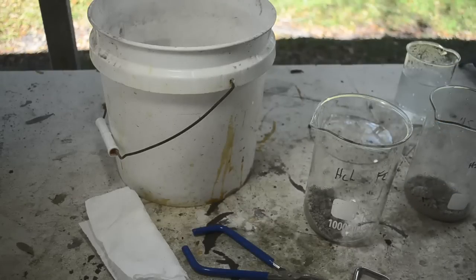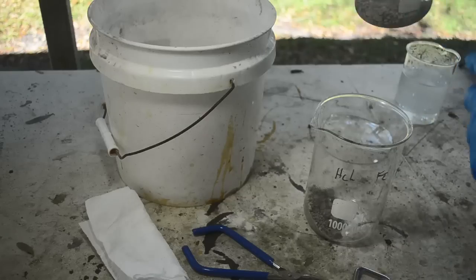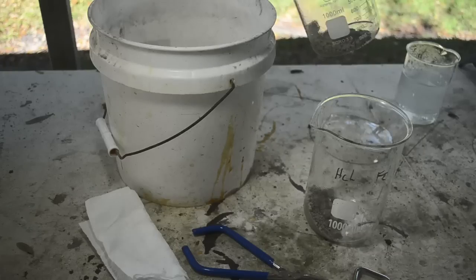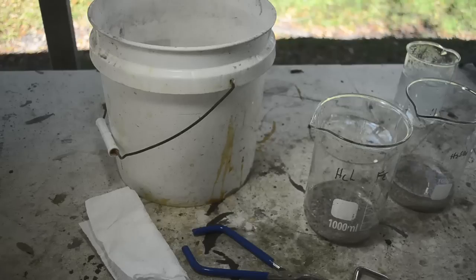Let me give this one a rinse or two. I'll go find my pH paper. And I'll test them and see if they need some more rinsing. They might. pH paper and find some more rinse water.